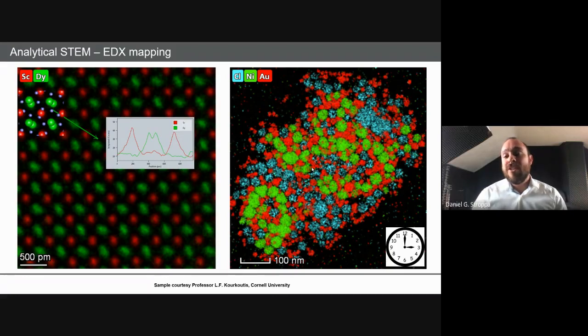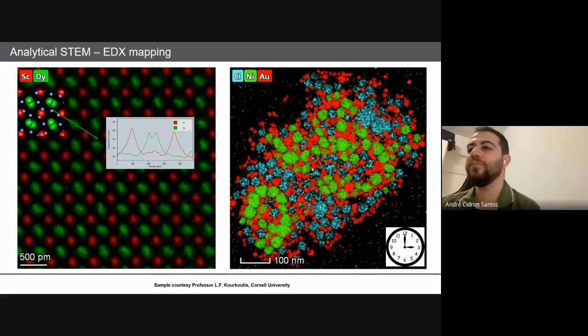Sir, you mentioned before that you can get from TEM images also oxygen vacancies. I want to know what the oxygen vacancy looks like by using TEM. Well, quite difficult, I would say. There are many ways that you can explore seeing vacancies or seeing different effects.